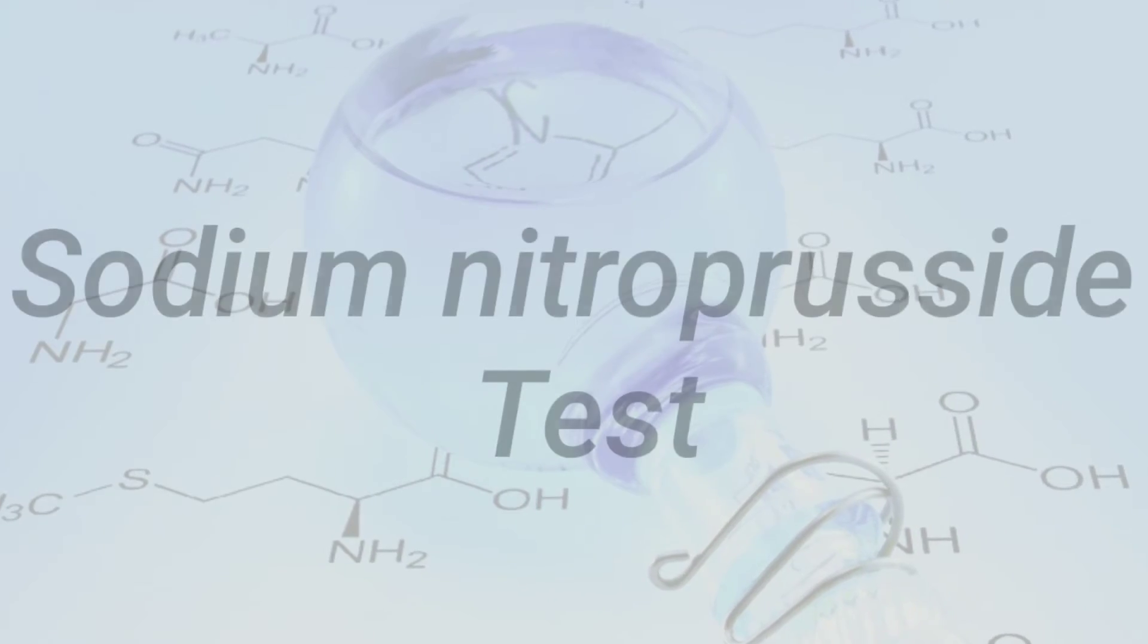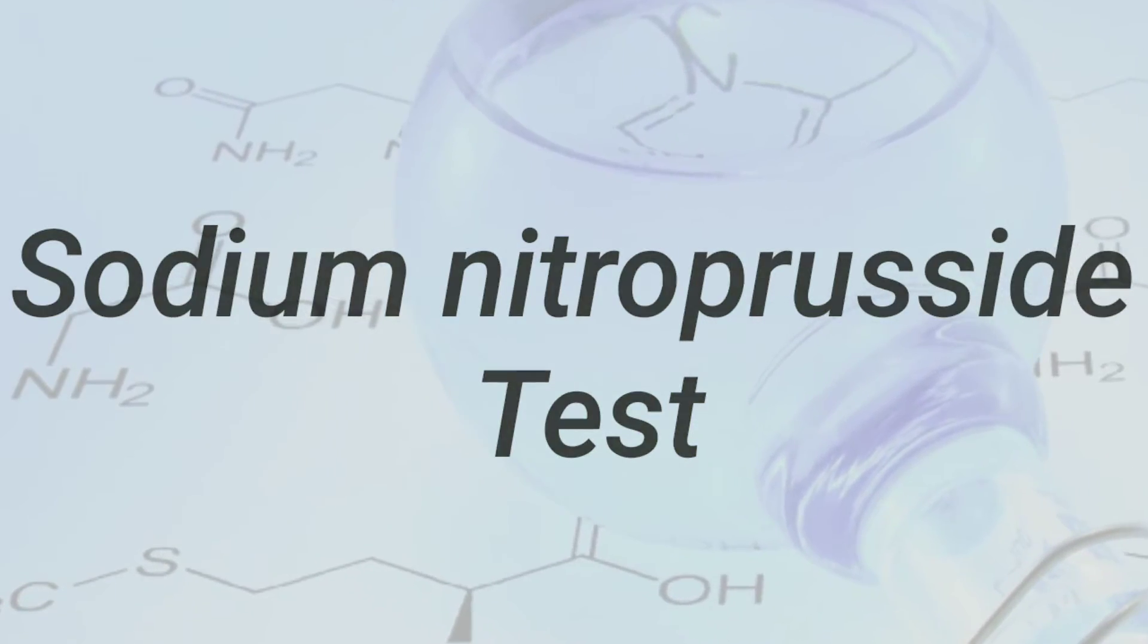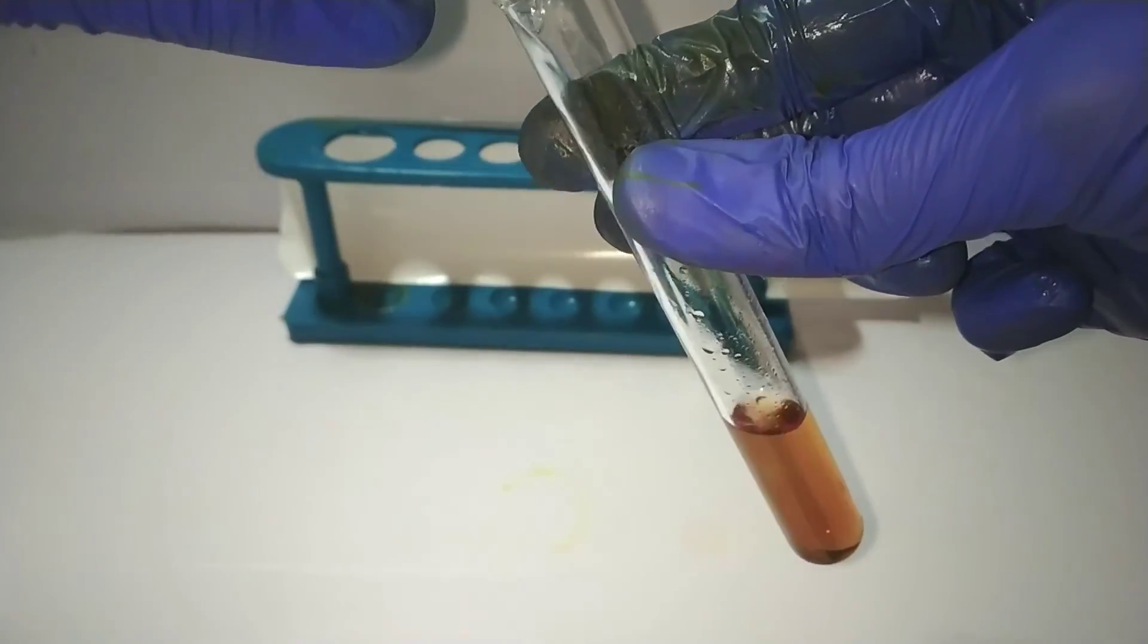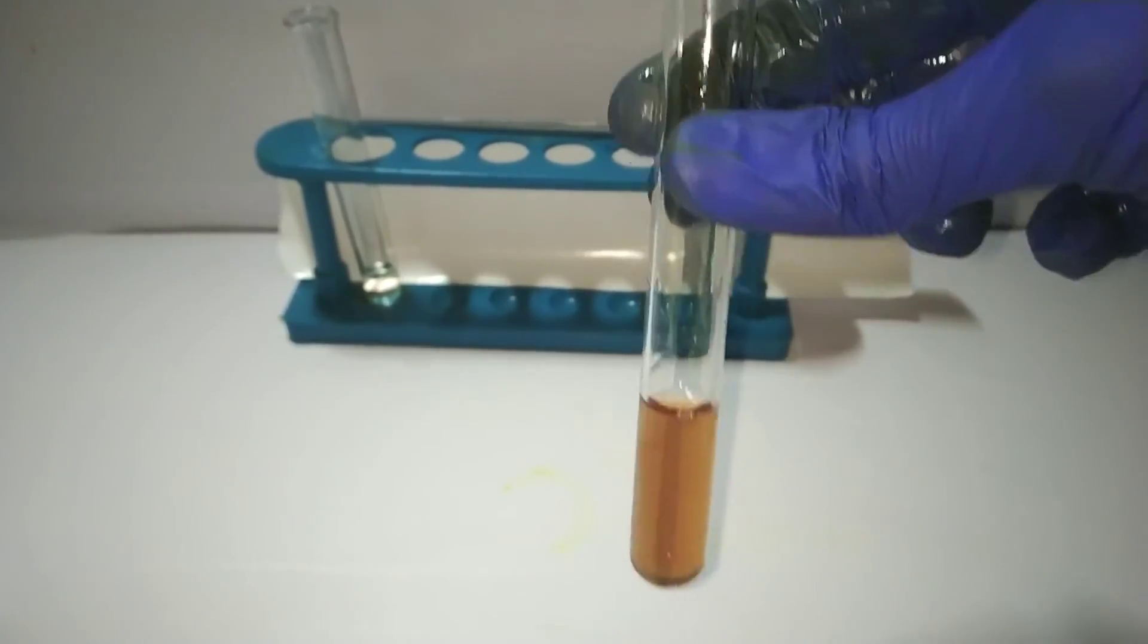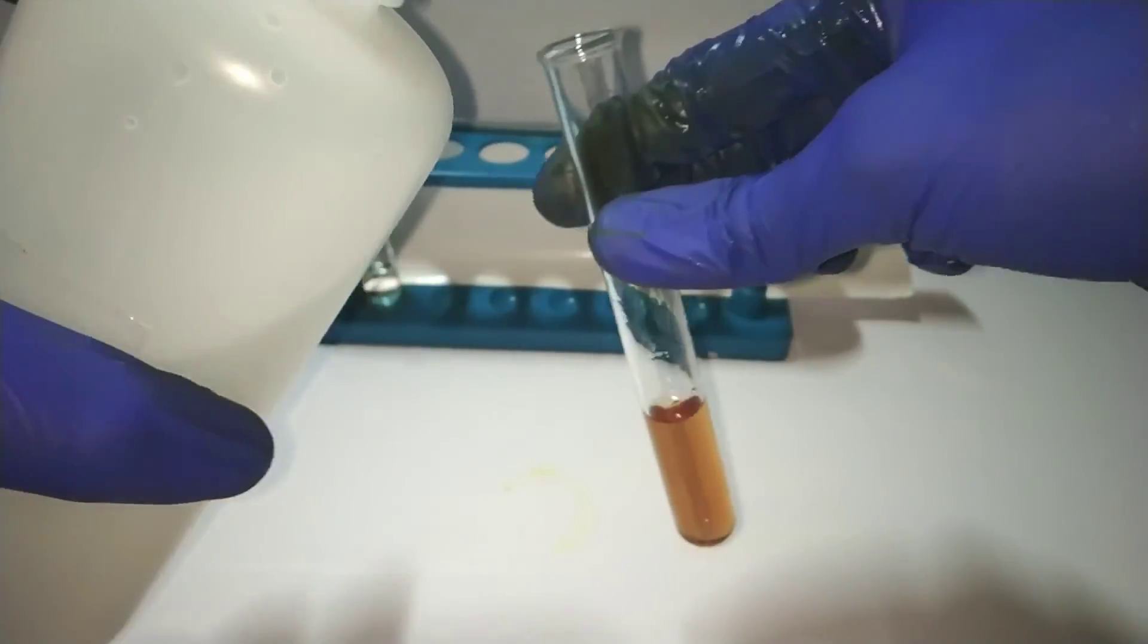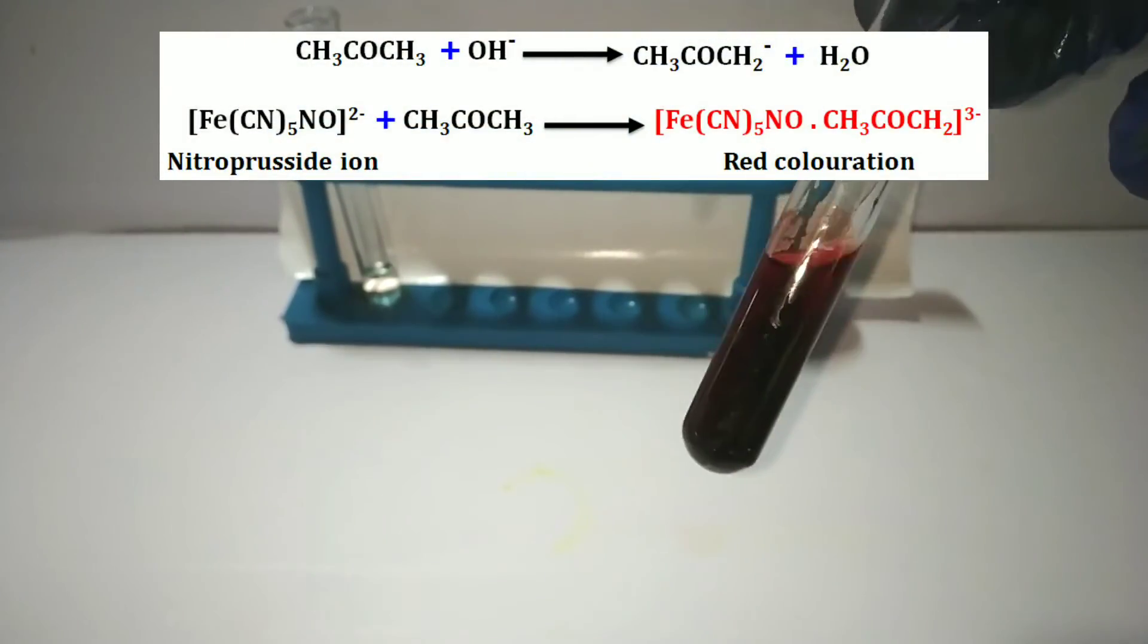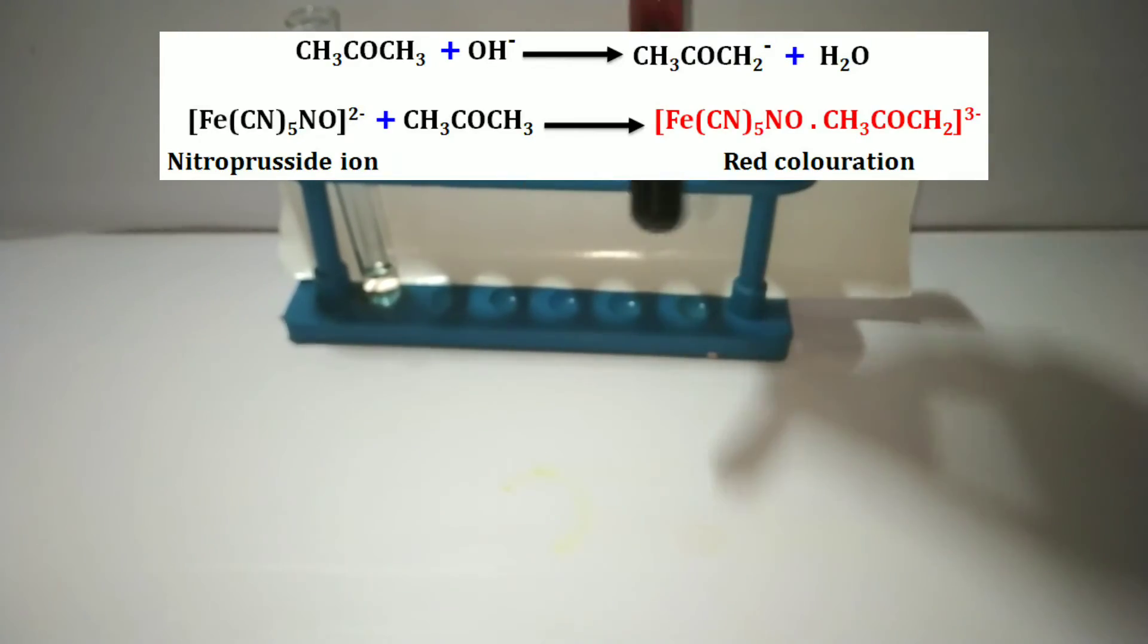The last test is the sodium nitroprusside test, which is also a specific test for ketone. For this test we take a few milliliters of the sodium nitroprusside solution in a test tube. Then we add the organic compound into it. After that, we add few milliliters of the 3 molar sodium hydroxide solution. Immediately you observe the formation of a deep red color. What's happening here is in the presence of alkali, ketones react with nitroprusside to form blood red colored complex.